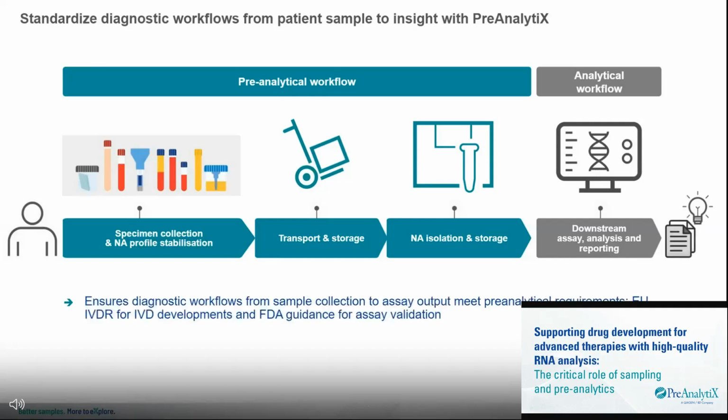We need to understand that all pre-analytical steps can have an impact on RNA profiles, quantity and quality of RNA, and that the molecular assay cannot discriminate anymore the changes that happened to the sample before. This can lead to a wrong diagnostic result because an artificial gene expression profile is generated due to the selected pre-analytical steps of the workflow.